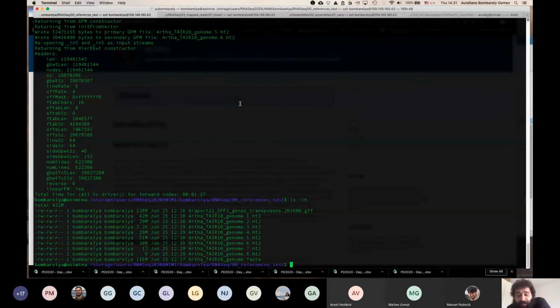She just wrote the command, pushed enter, and of course this was an old server with 64 cores, and she was using 64 cores because she wanted to run these things as fast as she could. So she clicked enter, waited 5 minutes, and didn't see any output. So she thought she was doing something wrong, so she ran the command again, waited another 5 minutes, and saw that nothing was produced.